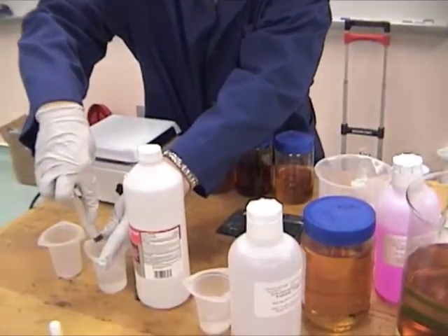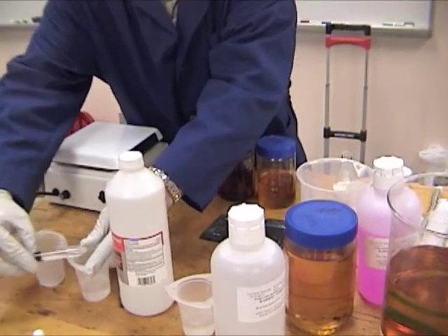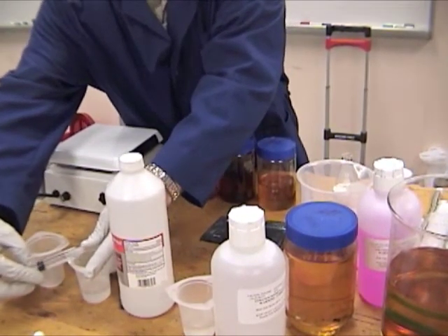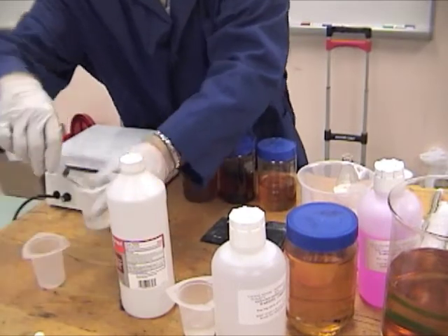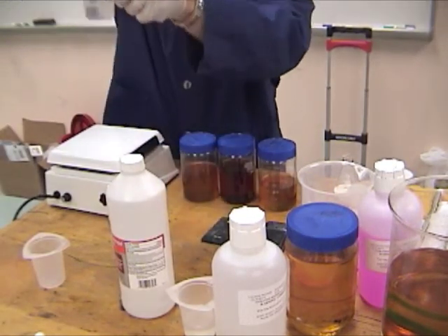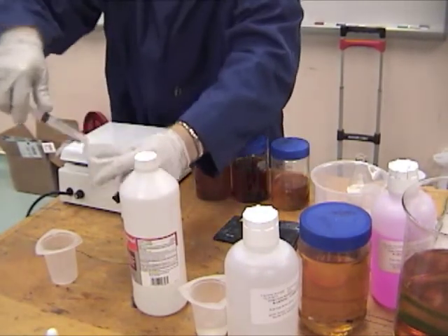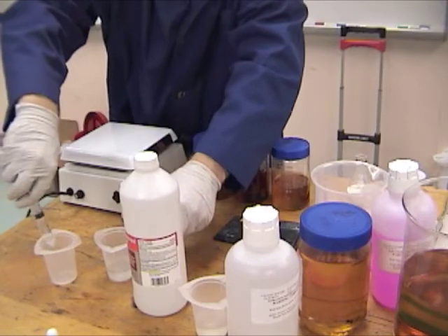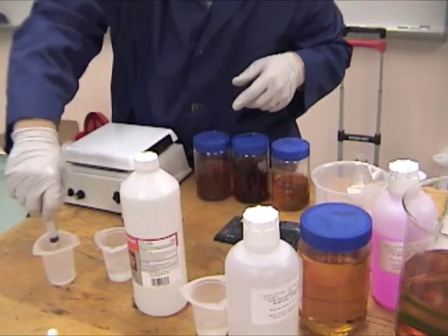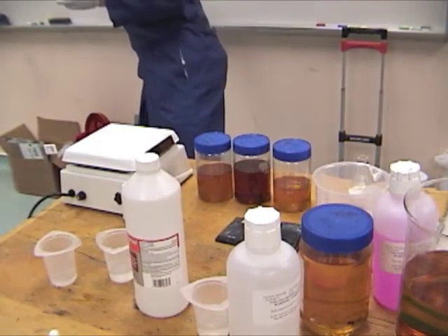So another 10. A lot of times you get this massive bubble. You just don't want the bubble in there. So I'm going to go way up past 10. I'm going to cheat. The bubble's sitting right on 10. I've got 10. So now I have a neutral alcohol solution. I'm sitting at 7 right now, okay?